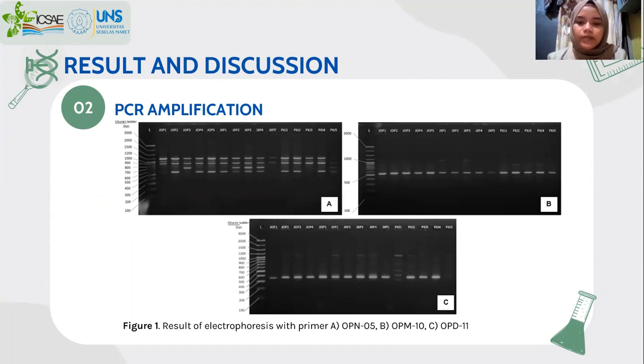The result of band pattern has variety. Therefore, the scoring is done on a band pattern that has strong intensity and brightness. Based on the visualization of DNA bands by the 3 primers, it can be seen that the intensity of the light produced is different. Some bands are faint and some are bright. The intensity difference in the resulting band can be influenced by the distribution of primer attachment, concentration, and genome purity.